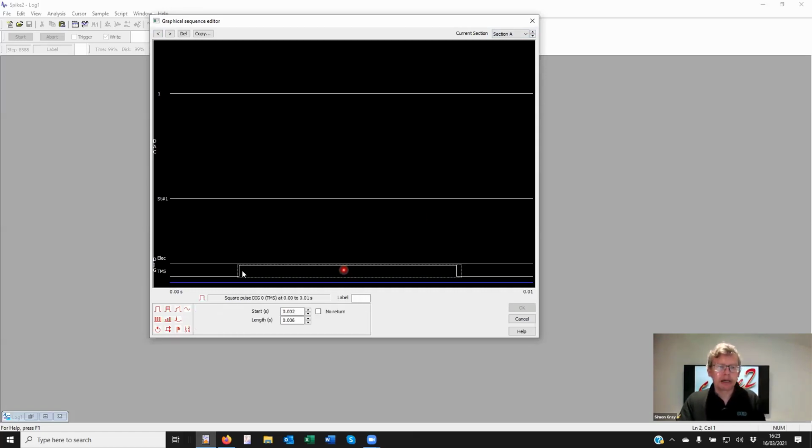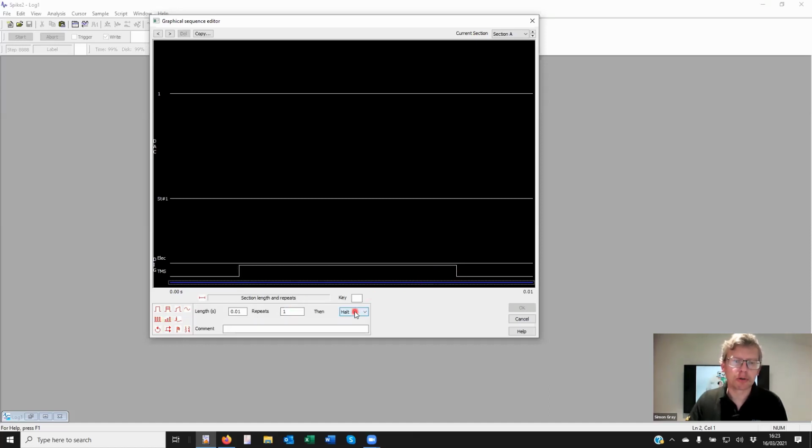So the idea here being that we're going to output 1,000, 10,000, 1 million pulses using just one output here, but then tell the system, the section, to repeat itself. Now, if I just go back to section A with repeats once, that would go on indefinitely until the sequencer is told to go elsewhere. Again, either through a key press, script control, or through the sequencer control box there. So we must calculate the time from this rising edge through to the end of this section and back around again to get the frequency output that we want.